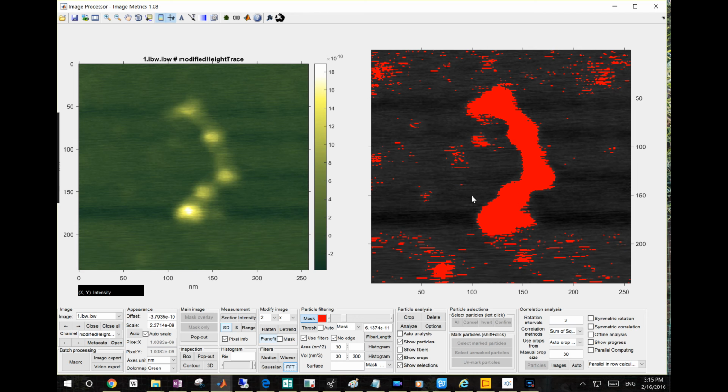So you see in the mask area, we no longer see that noise in the center, so this is pretty useful. Right, it looks pretty great. And so this is the case where you can remove periodic noise using Fourier transform, but you can also use Fourier transform to keep the periodic information, especially in protein crystal structures.